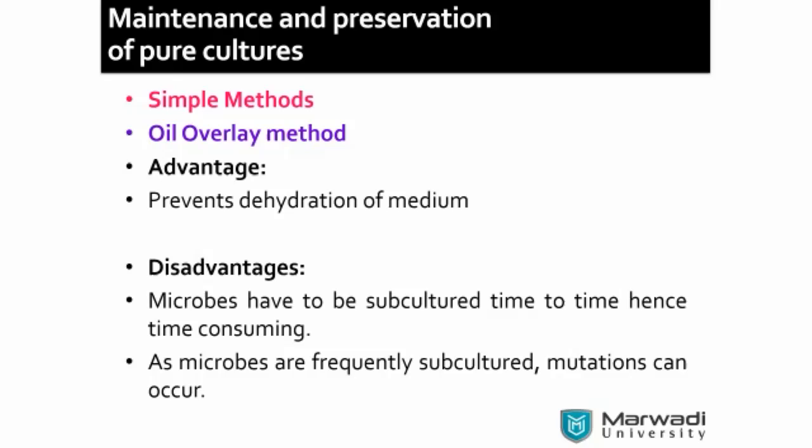If you are using a defrost mode refrigerator for preservation purposes, what is going to happen? After a while the circuit becomes hotter, and the water vapors are sucked up. So continuously water depletion is going to happen. Whether it is in medium, there is a cotton plug, it is like a suction pump. Continuously the suction pump is taking place.